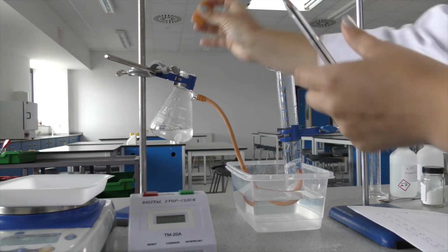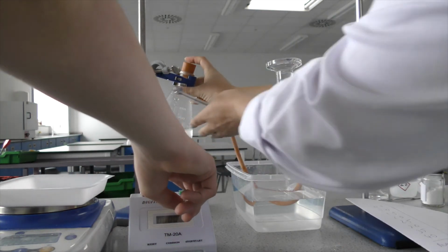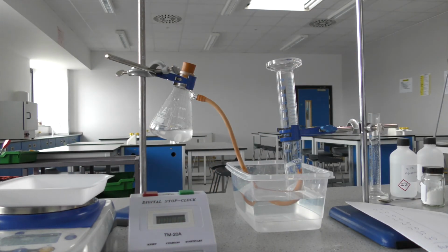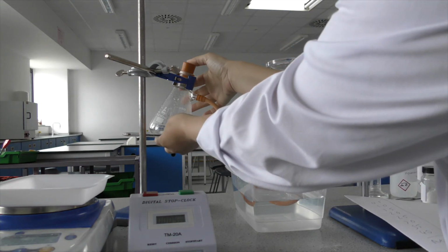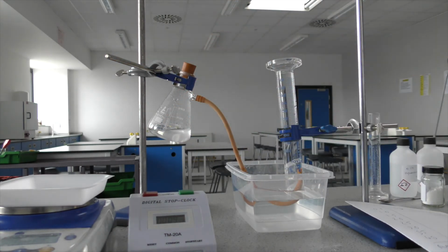Place it in quickly, the reaction started, put the stopper on, and then start the timer. And every 30 seconds we will measure the gas released. It's important that the stopper's on tight because we don't want any of the gas to escape. That would affect our results.